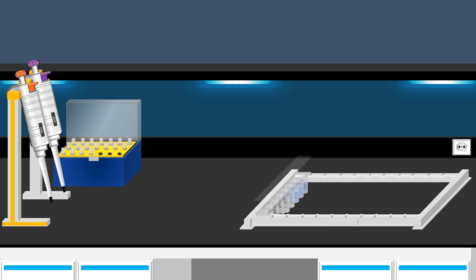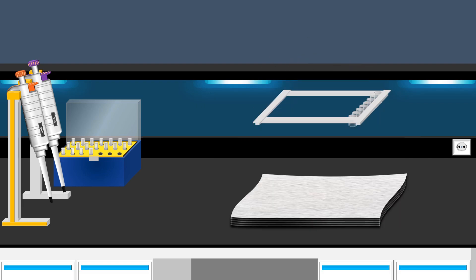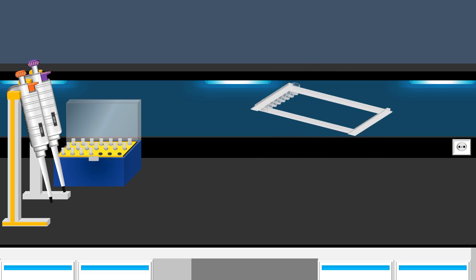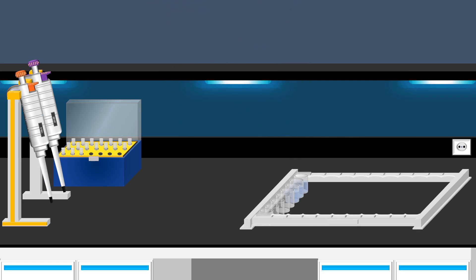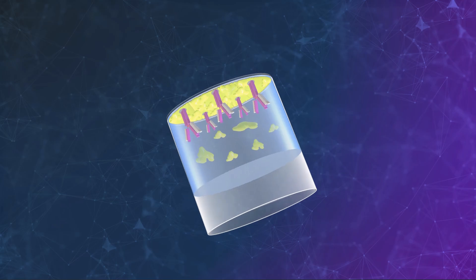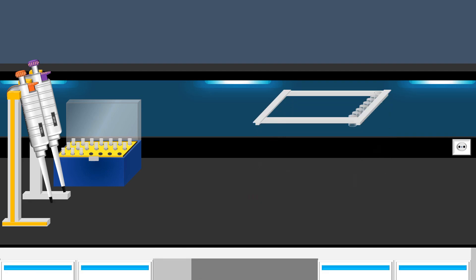After completing the blocking step, the adhesive plastic is removed, followed by discarding of the blocking solutions. An absorbent paper towel is then used to thoroughly absorb any remaining solution. Next, the wells are thoroughly washed with the wash buffer. This step helps to ensure that any remaining blocking protein is thoroughly removed from the wells. After discarding the wash buffer, any residual liquid is removed using an absorbent paper towel.